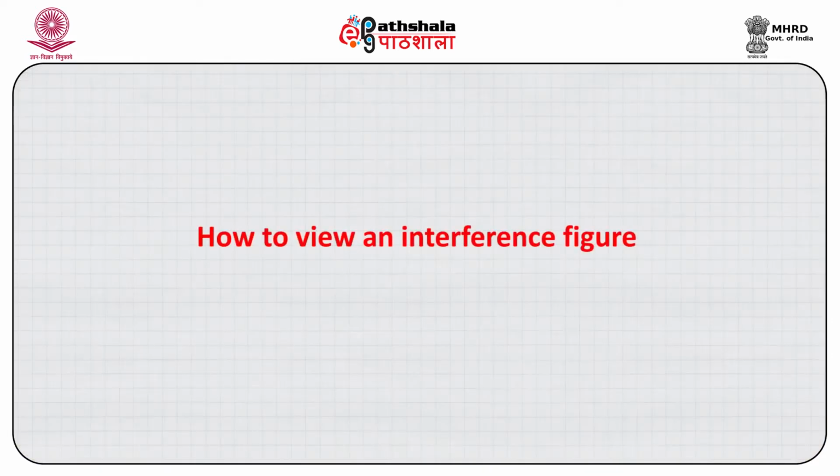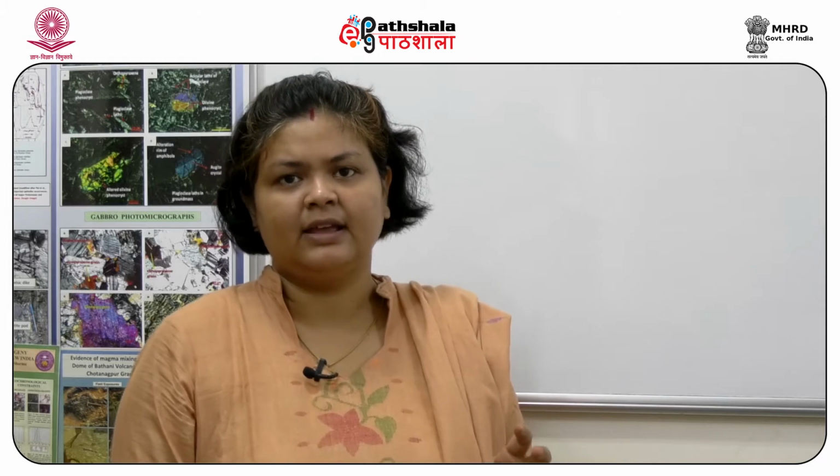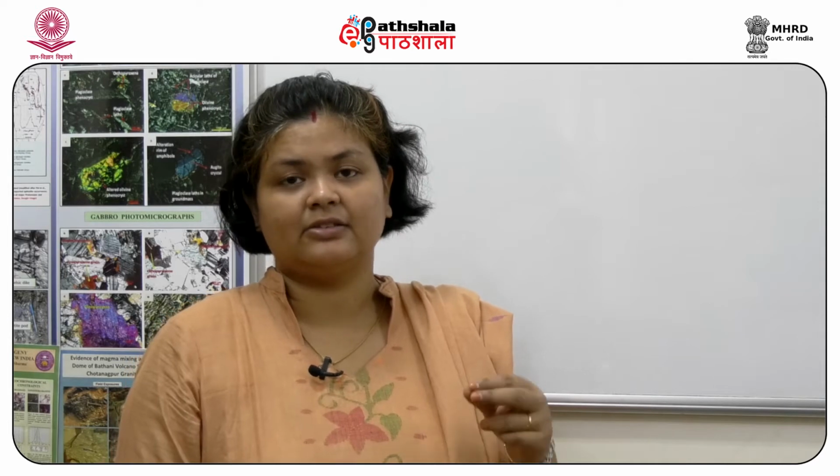So, how do we obtain an interference figure? For this, we observe a thin section under the microscope, choose a grain and observe it under the maximum objective lens available in the microscope. After that, we will insert the condensing lens or the auxiliary condensing lens, and we will also open up the iris diaphragm and readjust or refocus the mineral all over again.